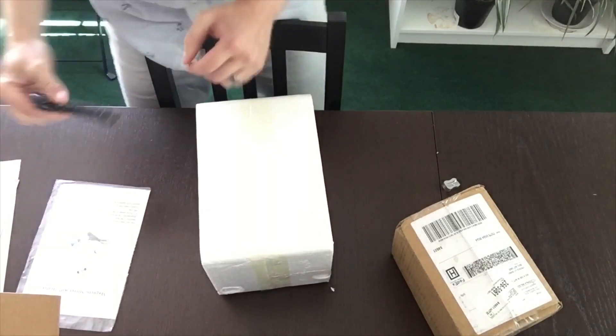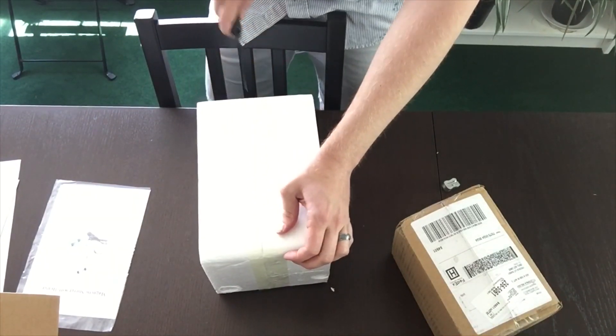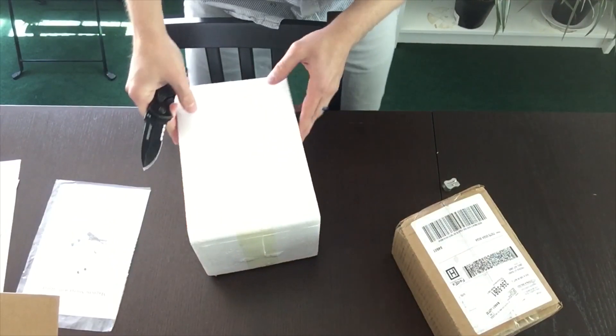The hotplate itself comes packaged in two styrofoam halves that are taped together to protect it. And here I'm just trying to get the thing open.